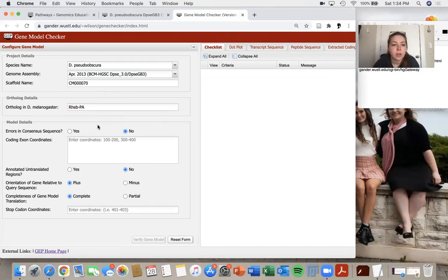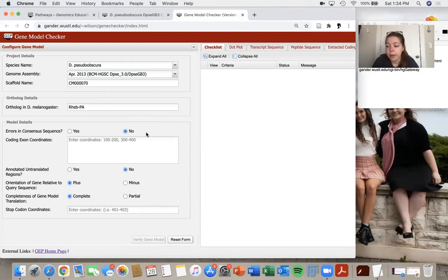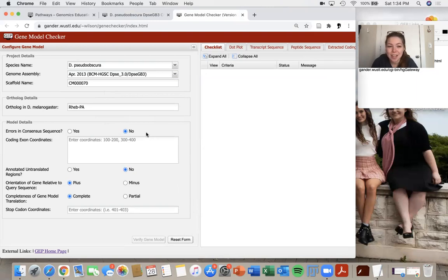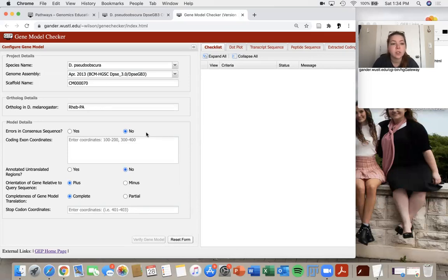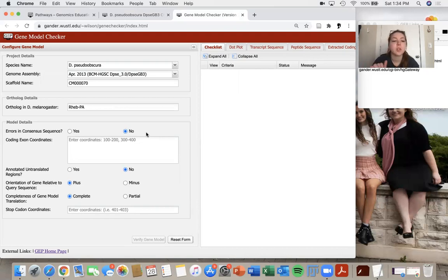So the next question is errors in consensus sequence. So we're going to assume that we don't have any error in our consensus sequence. And we're just going to select no. If you think that you do have an error in your consensus sequence, for some reason, that would be a situation where we would ask you to contact the TA so that we can give you a little bit more guidance on that.